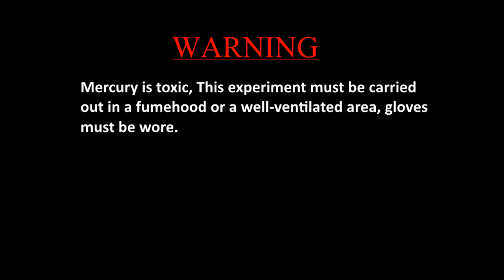Mercury is toxic. This experiment must be carried out in a fume hood or in a well-ventilated area. Glasses must be worn.